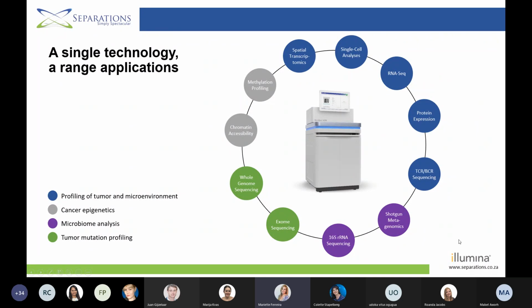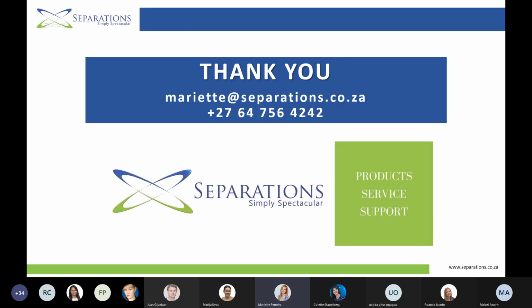For microbiome analysis, we can do both 16S rRNA sequencing as well as shotgun metagenomics. And for your tumor mutation profiling, we can do exome sequencing and whole genome sequencing. And with that, I thank you for listening. If you have any questions, please let me know.